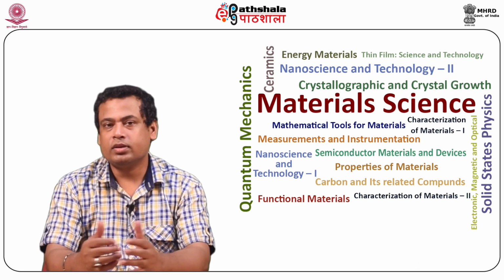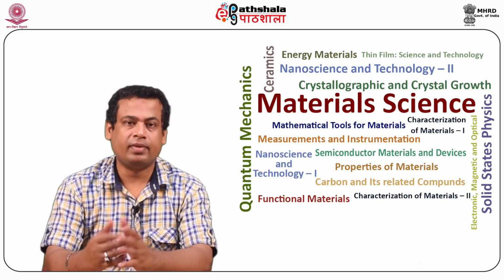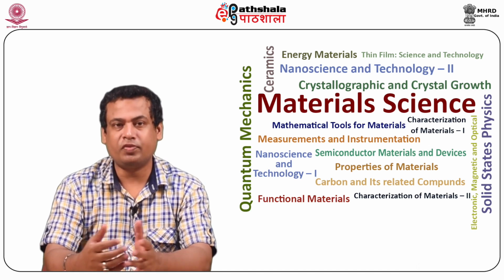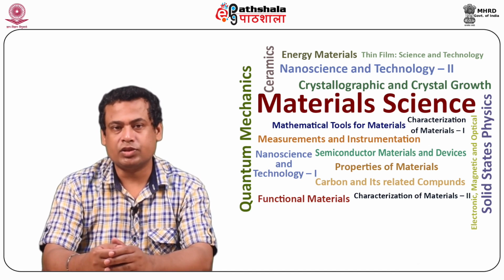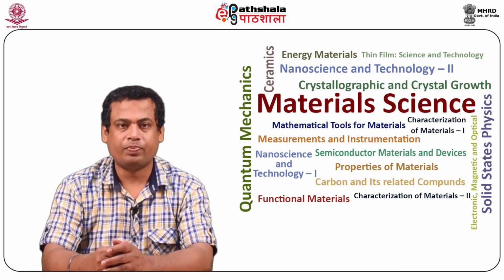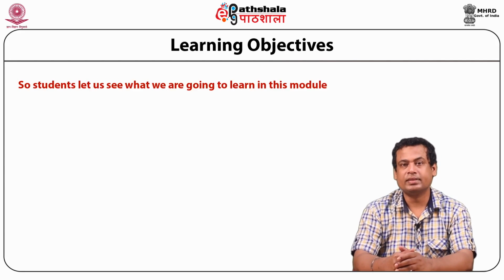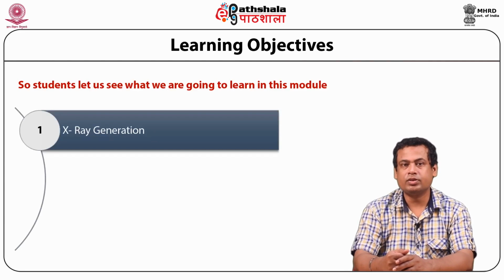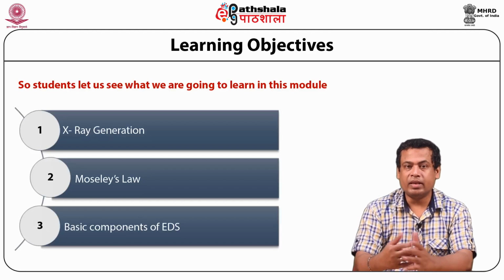Today we are going to talk on the module Energy Dispersive X-ray Spectroscopy of the topic Surface Morphology, coming under the paper Characterization Techniques for Materials 2. After completing this module, the students will be able to understand what X-ray generation is, about the Moseley's law, and the basic components of the EDS system.